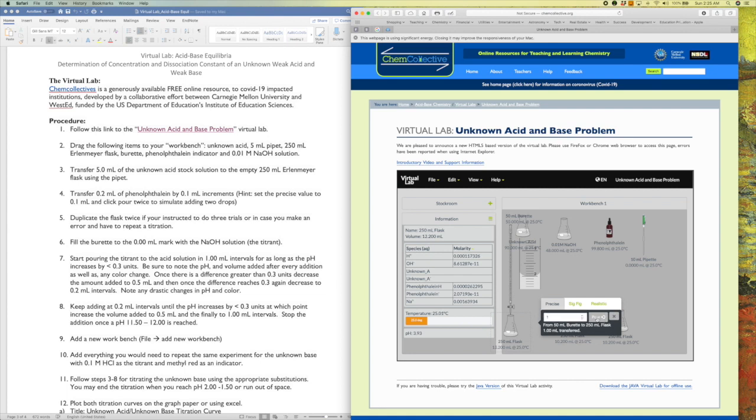And you see now that I went from 3.68 to 3.93. So that's about a little less than 0.3. So that's okay.